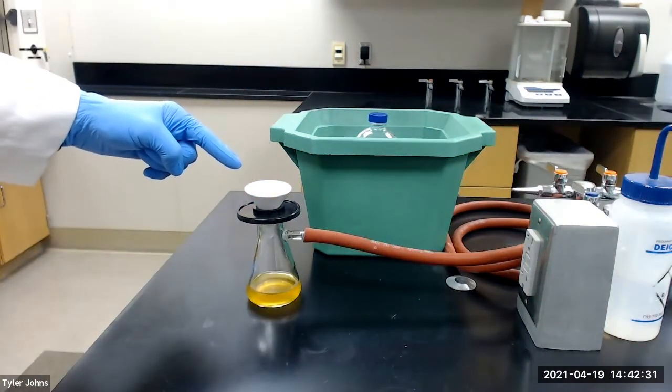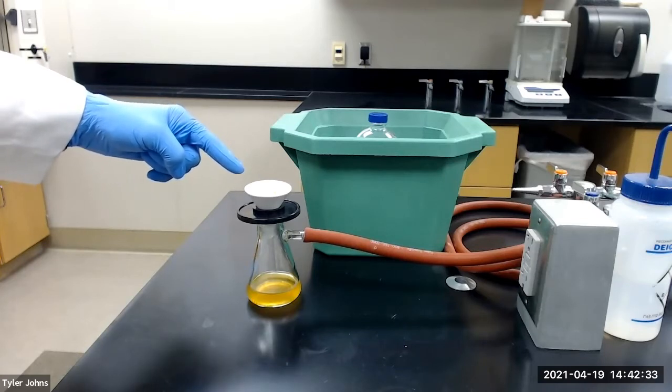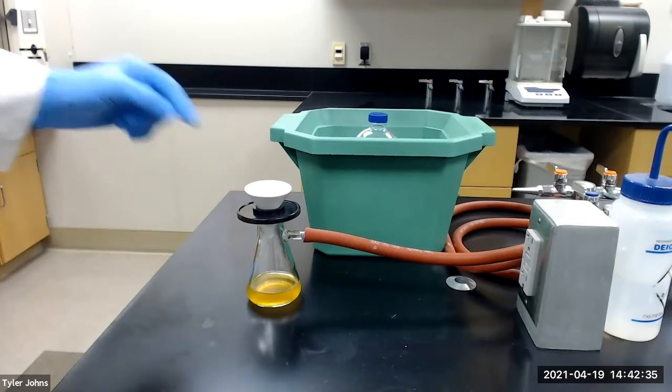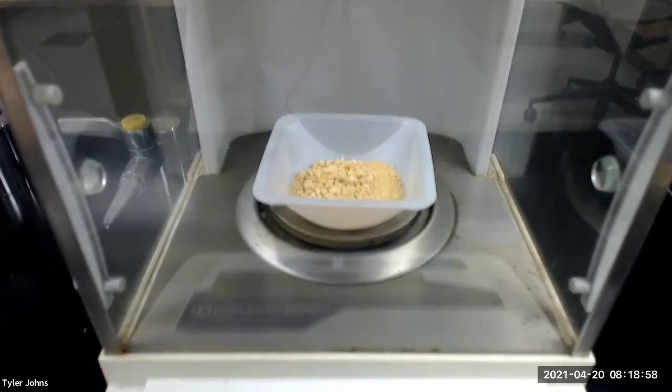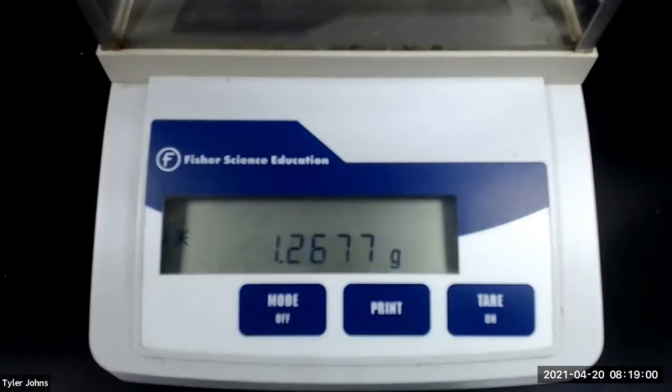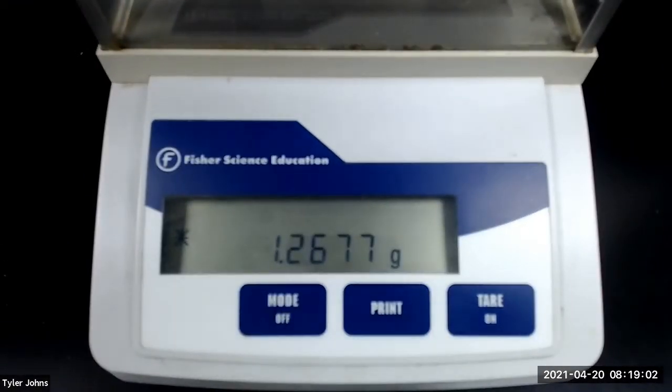After drying for 30 minutes, we will next determine the mass of the crude product. The mass of the crude product is 1.2677 grams.